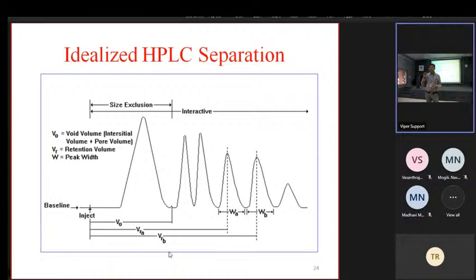The thing here is understanding the selection process of solvents and mobile phase, the selection of the stationary phase, and the selection of the pump pressure. After that, they will get the result, and understanding and interpreting the results is important. These are all the unique features. We need to acquire this knowledge as a chemist or as a pharmacist. Your growth depends upon your understanding of the concepts. You should work intellectually rather than physically. 95% of people will work physically, submit the sample and get the result. That will decide your growth.